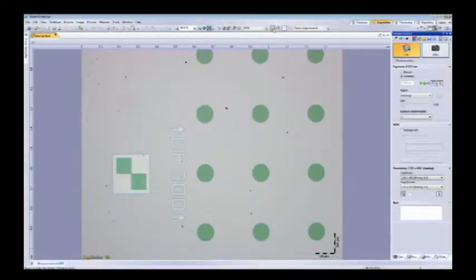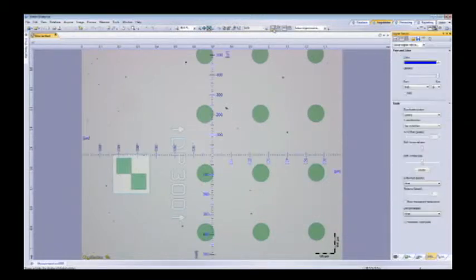So now we have a built-in toolbar interface in PowerPoint where we can send captured images directly into a PowerPoint presentation you're working on, modify those images directly in PowerPoint, and be able to save those presentations right back to your database once it's done. One other new feature added on the screen for live quick measurements is a digital reticle.